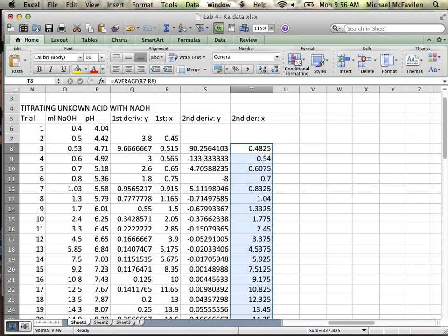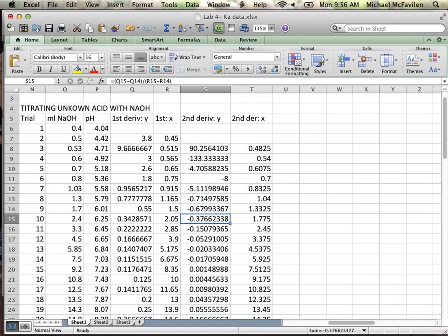Okay, remember we said that theirs was a diprotic acid, which made this a little bit more difficult at the front end. So let's ignore the front end of the data, and now take a look at the slope, the slope at the second derivative. Let's start looking at those values. Are they big or small? Very small. They're all hovering around the 0 slope.